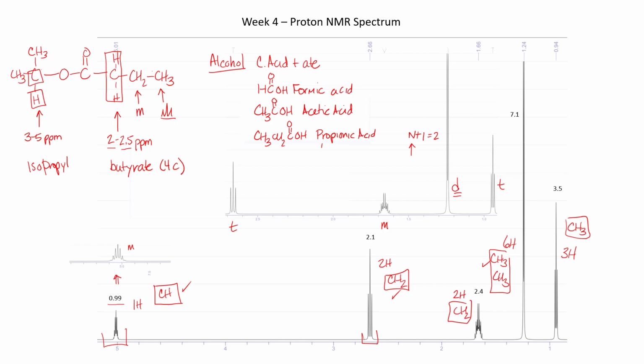So this would be a propanoate, most likely. This would be an acetate, and this would be a formate. And basically those are your only choices.